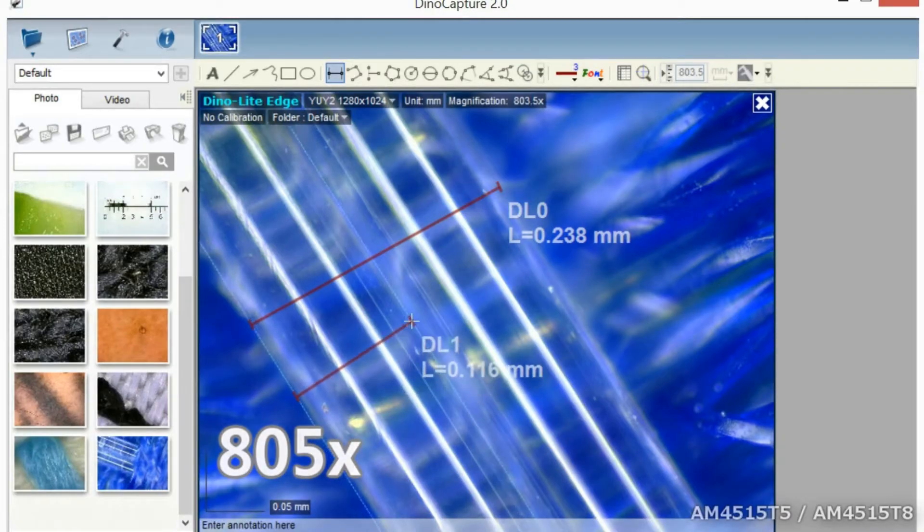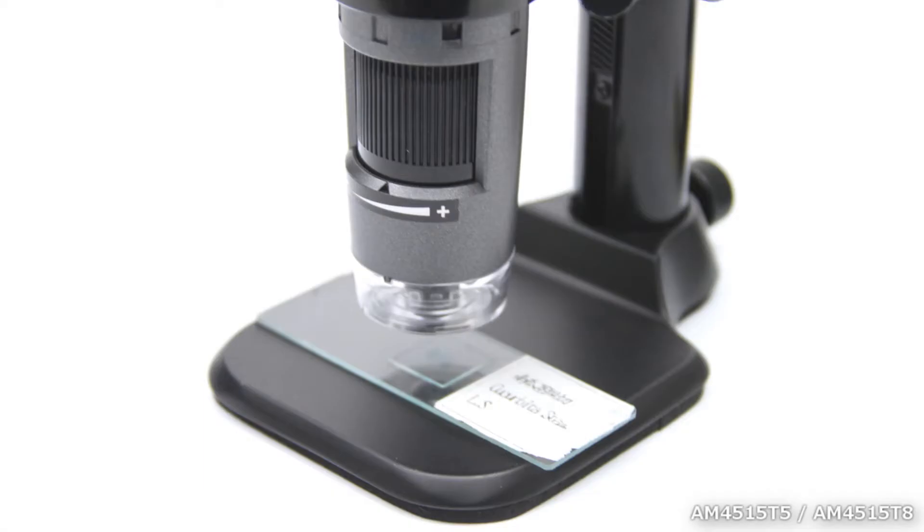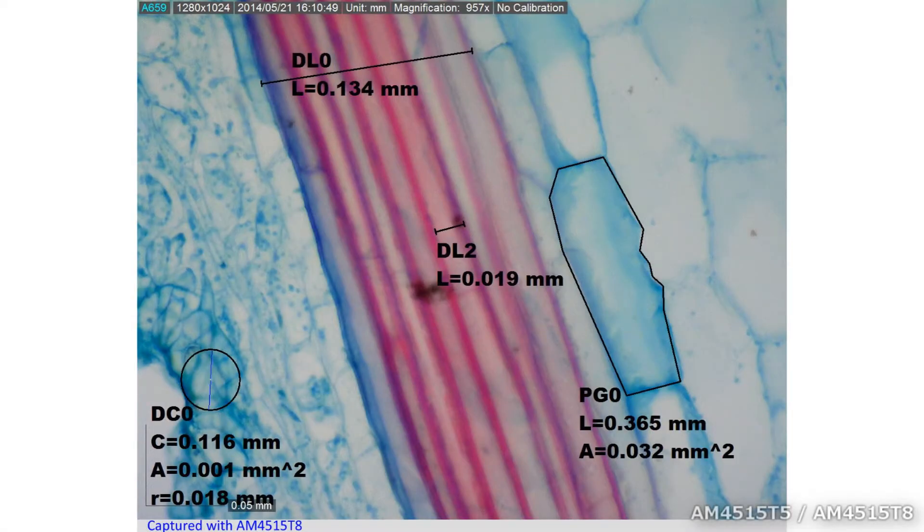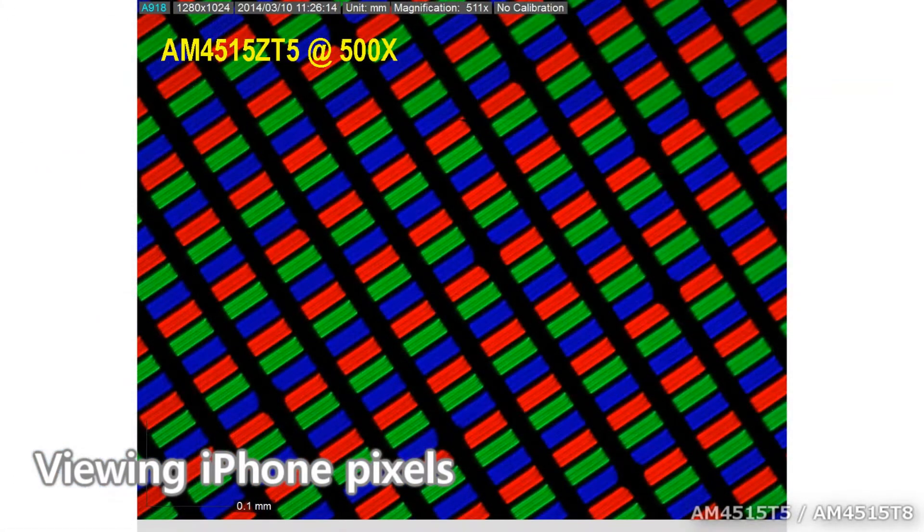These handheld Dynalight microscopes connect directly to a computer via USB 2.0 and use the included feature-rich Dino Capture 2.0 software which allows users to capture images, videos, and perform measurements and much more.